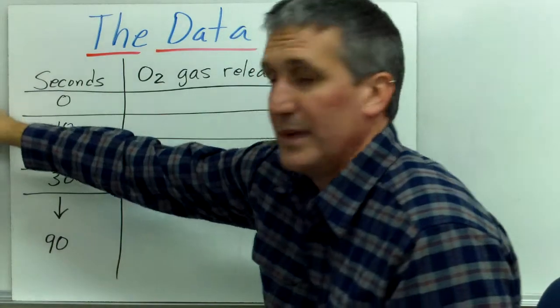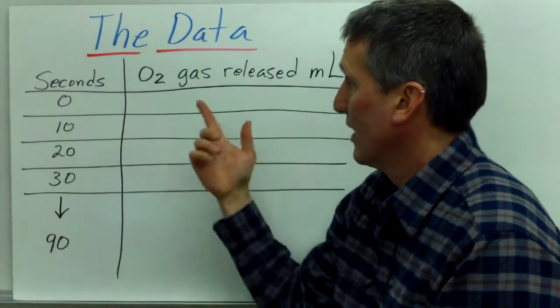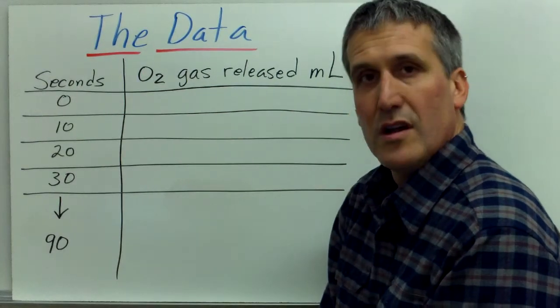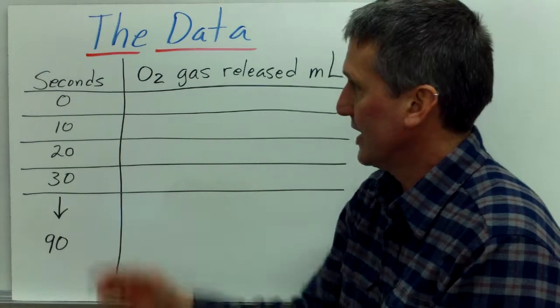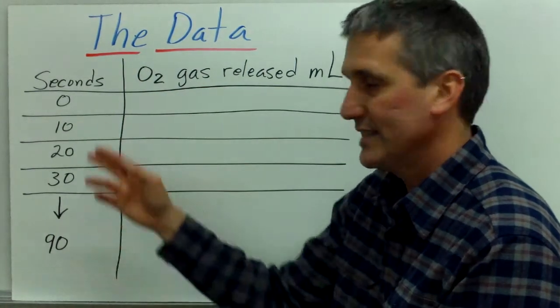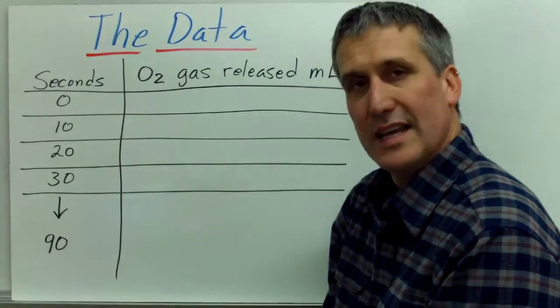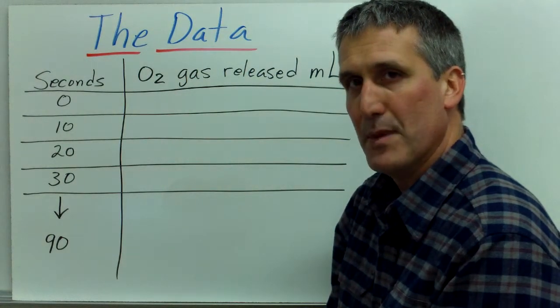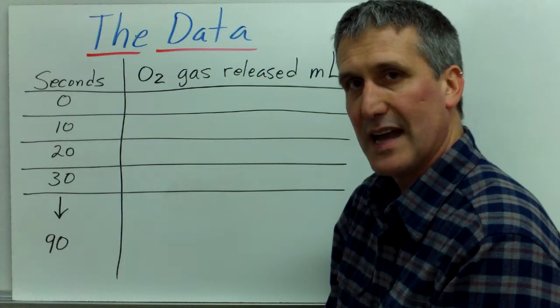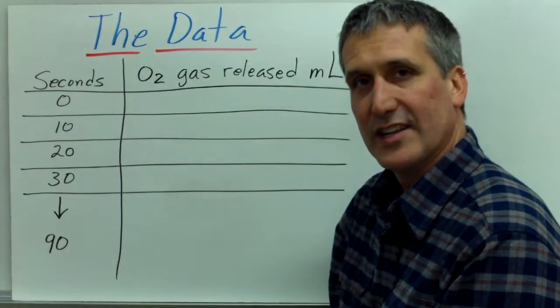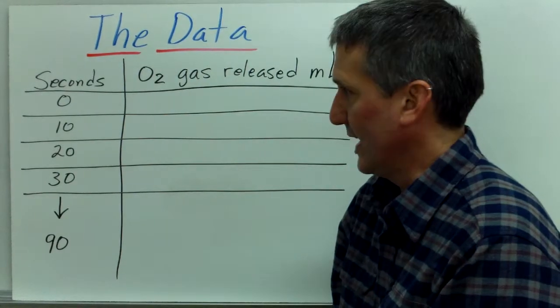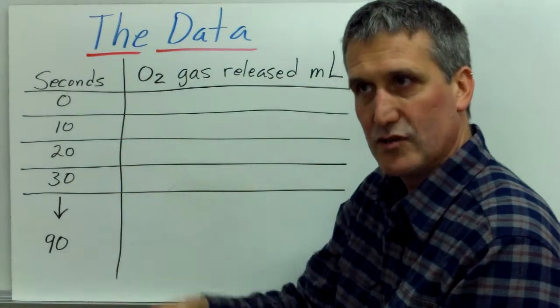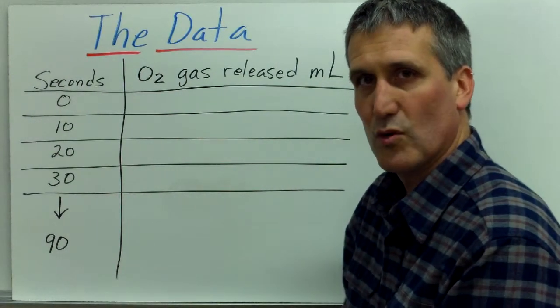What kind of data are we going to be collecting in this activity? We are going to be doing each one of these trials where we vary the factor that affects the enzyme action. We are going to be doing it over 90 seconds, and every 10 seconds we will be seeing how much water has been displaced by the oxygen gas. How many milliliters of water has been displaced by the oxygen gas, and that will be our indication of reaction rate. We will do that for each trial when we vary either the substrate concentration or the enzyme concentration or the pH or the temperature.